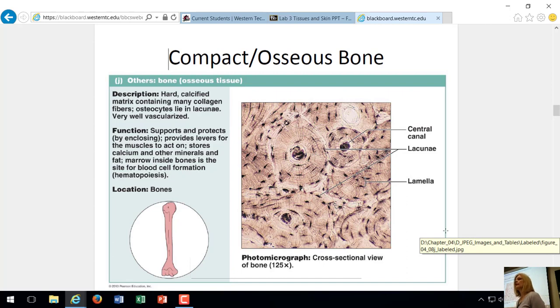So it's very painful when a person has a break in their bone, even if it's just a crack. What type of fracture causes cracks? Hairline fractures, greenstick, stress fractures could sometimes just be minor cracks in bone. But anyway, this is the strongest tissue in the body. Look for the rounded kind of target appearance to this bone. And it's called compact bone. Make sure you say compact or osseous because there's different types of bone in the body. There's spongy bone that we're going to talk about when we get to the skeletal system. But for right now, just call this compact or osseous bone. Another type of connective tissue.